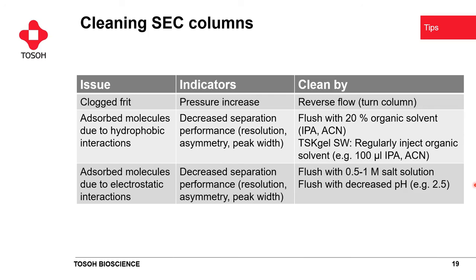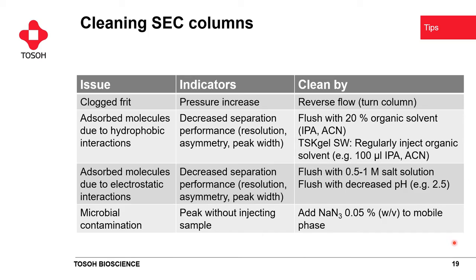and if they interacted by a negative charge, they will not interact afterwards anymore. Last but not least, what we may also find, in particular after storage of the column, is microbial contamination, meaning we see UV signals coming out of the column even though we did not even inject anything. And to this end, we can add sodium azide to the mobile phase, also to the storage buffer. For storing, another possibility is to store it in 20% ethanol, but again, this might not be applicable to all silica-based columns.